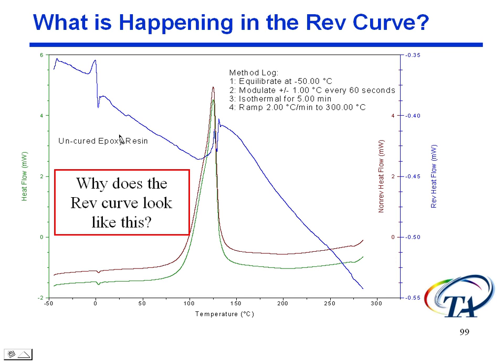And what he was really concerned with was the reversing curve. And look at this garbage here and this garbage here. Now this exothermic peak in this region, this was epoxy material, so this was curing. And this is uncured material, and it goes through a curing process.